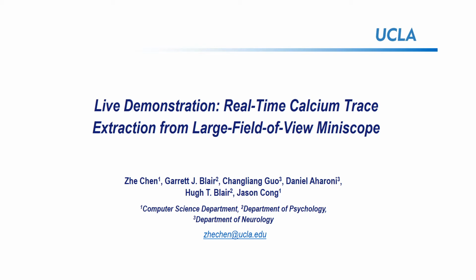Hello everyone, I'm Zhe, postdoc researcher at UCLA. Today I'd like to present our recent work as a live demonstration entitled Real-Time Calcium Trace Extraction from Large Field of View Miniscope. This work is a collaboration across Computer Science Department, Department of Psychology, and Department of Neurology at UCLA.